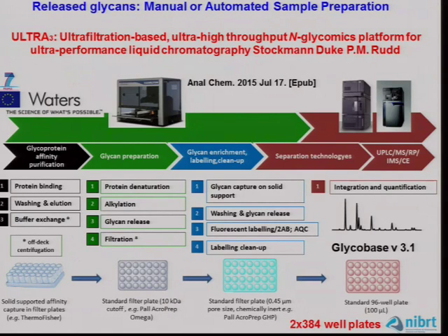especially if you're going to go onto mass spectrometry, because if you don't clean up here, you probably won't get a mass spec signal, because the mass spec doesn't like detergents, it doesn't like salts, it doesn't like bits of old protein that are hanging around. So this cleanup step is really vital.